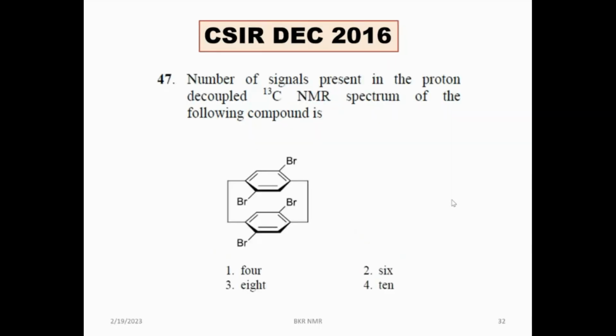Did we finish this molecule in the last class? No, ma'am. Could you tell me how many signals for this molecule? 4. How? You can cut the molecule like this. Yeah, you can cut the molecule like this.